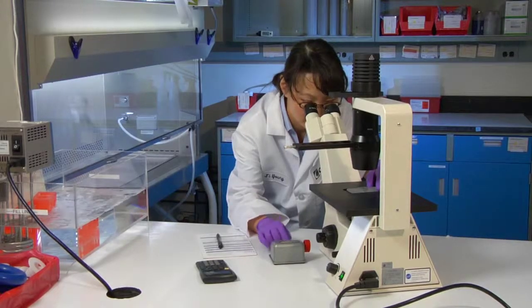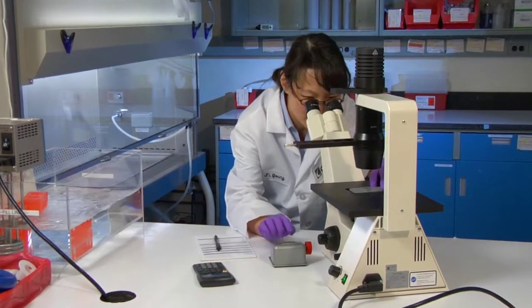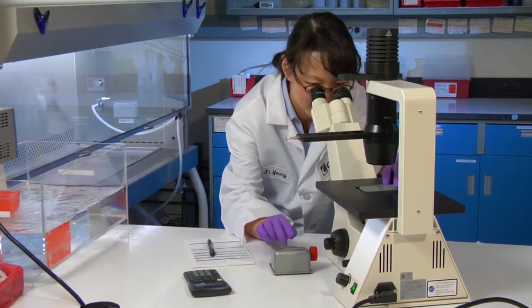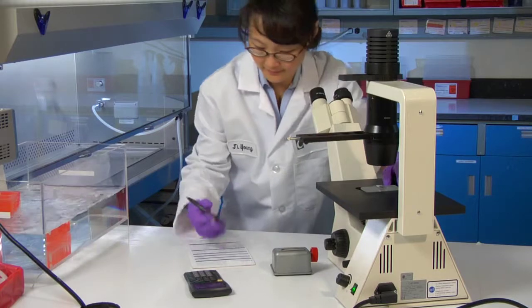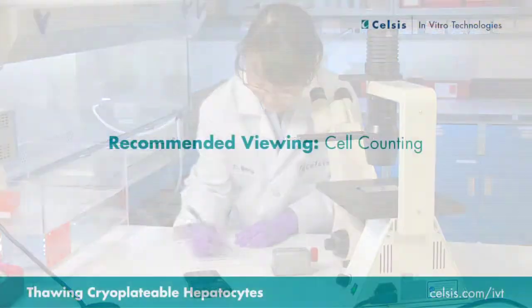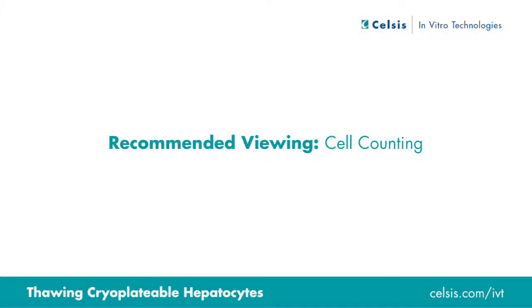The next step is to perform a cell count using the trypan blue exclusion method. This will determine the percent viability of plateable hepatocytes. All Celsis IVT hepatocytes are tested by our independent quality assurance lab to have a minimum of 70% viability.